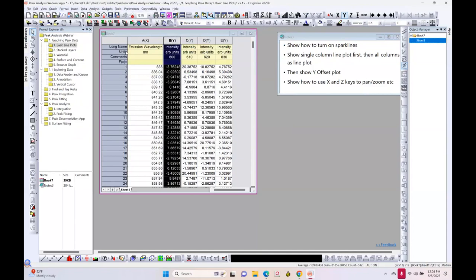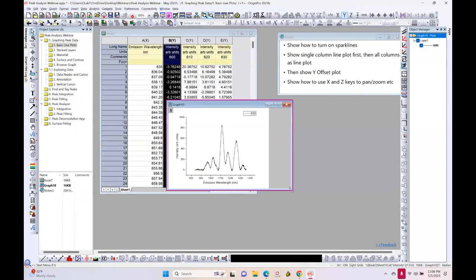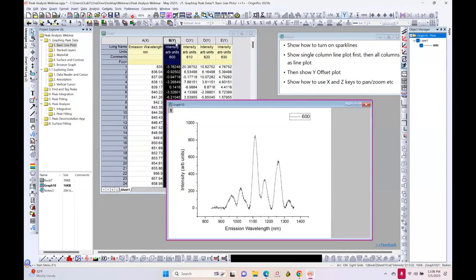I'll select one column and go to the plot menu. Under basic 2D, I'll make a line plot. When you select a column and ask for a plot, Origin uses column plot designations. By default, the worksheet is set up as X, Y, Y, Y. If I choose a Y column, Origin will look to the left to find an X column and automatically use it for the X axis. You can see Origin automatically picked up column A as X, plotted column B, and the long name and units from the worksheet header were used to annotate the graph nicely.